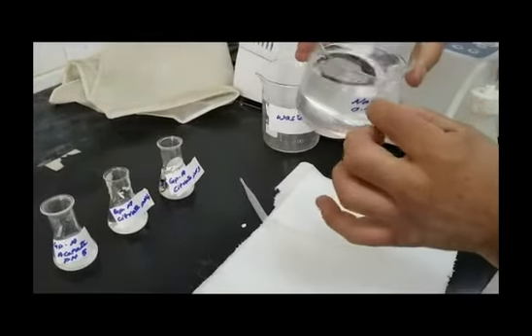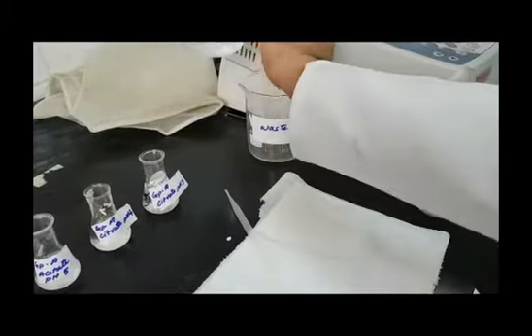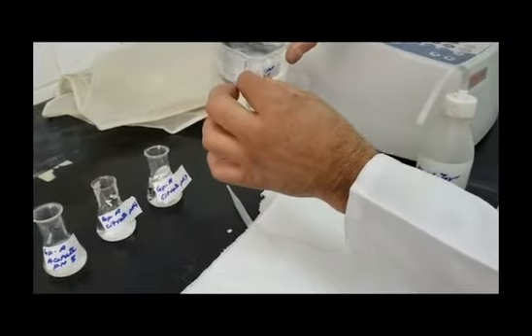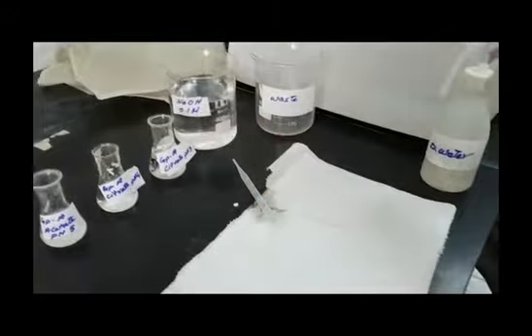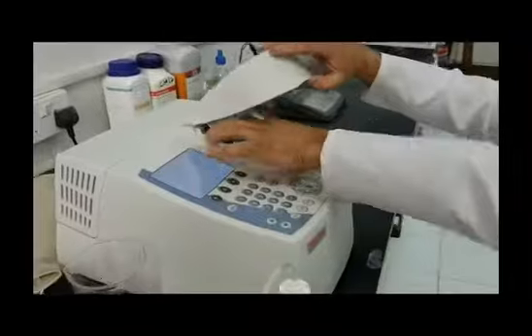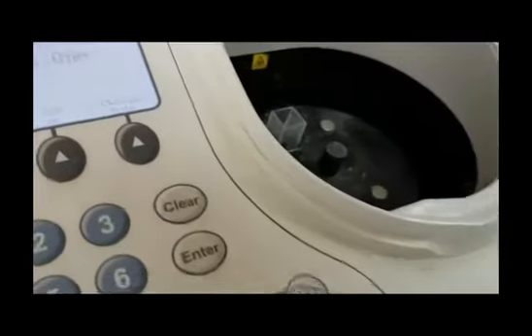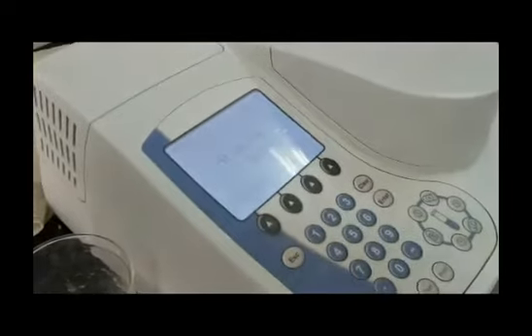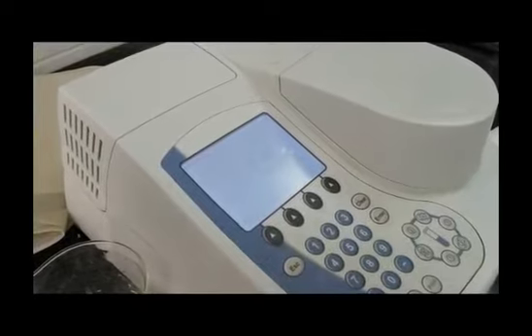Start with cleaning the cuvette. First, we always clean it with distilled water several times, then using the blank also several times. After doing so with our cuvette, fill it with our blank, which is again sodium hydroxide as we discussed earlier, and place it in its position in the correct direction such that the transparent faces are toward the UV spectrophotometer light beam.